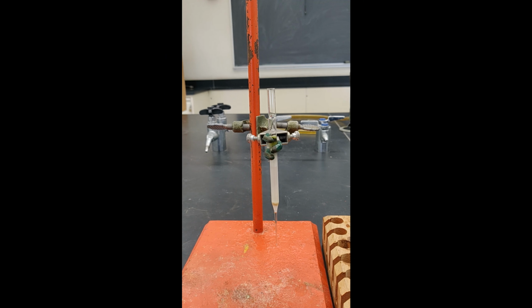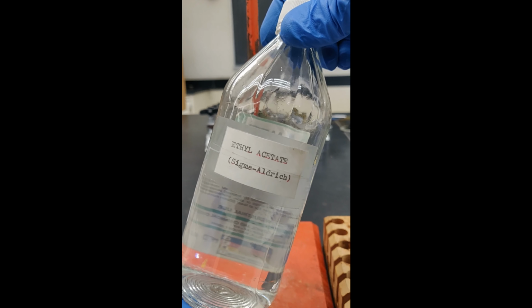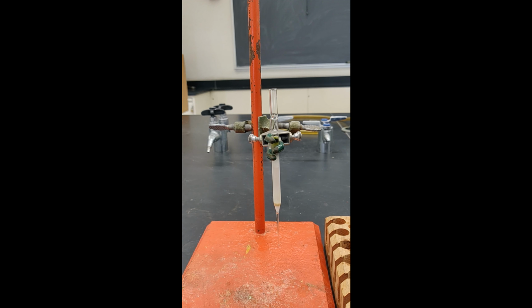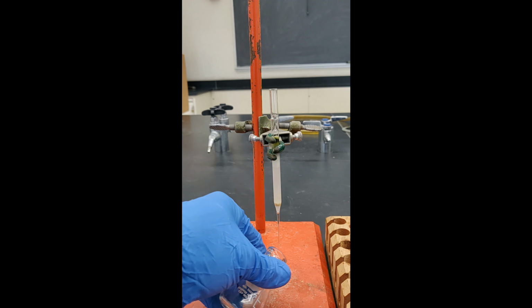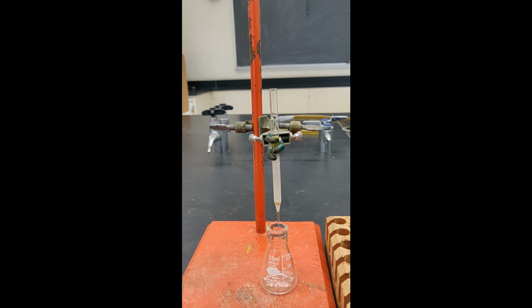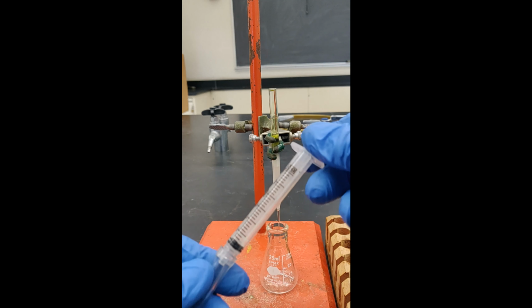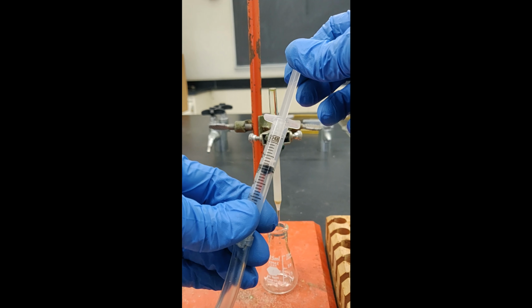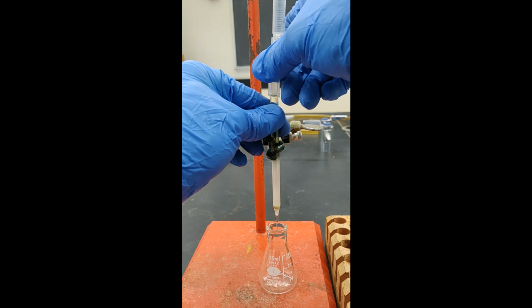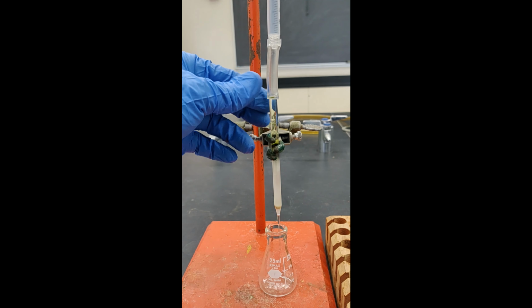Now fill the empty space above the silica with 100% ethyl acetate, the second eluent, to elute the more polar pigments that better adhere to the stationary phase. After adding ethyl acetate, carefully use air pressure from either a rubber bulb or the syringe Tygon tube apparatus to force all the remaining pigments down and off the column.